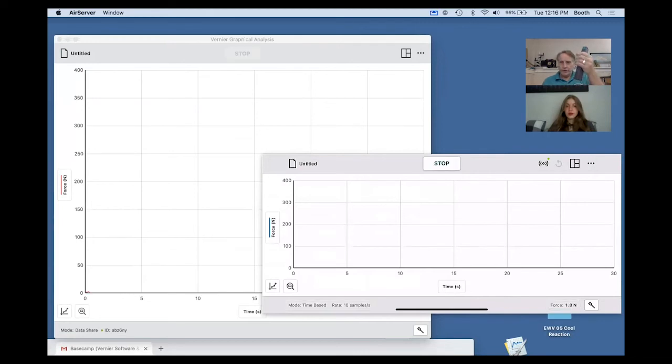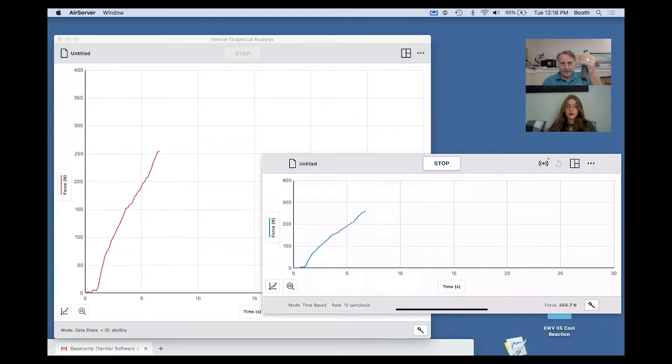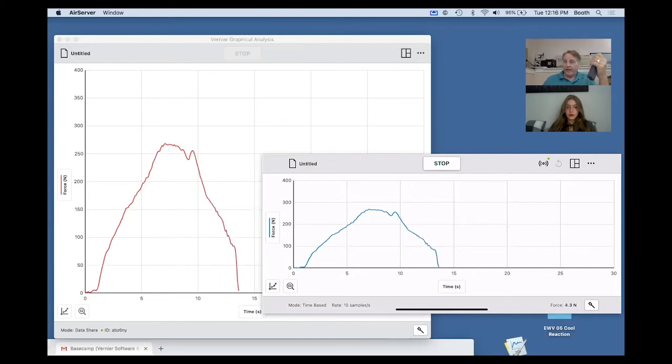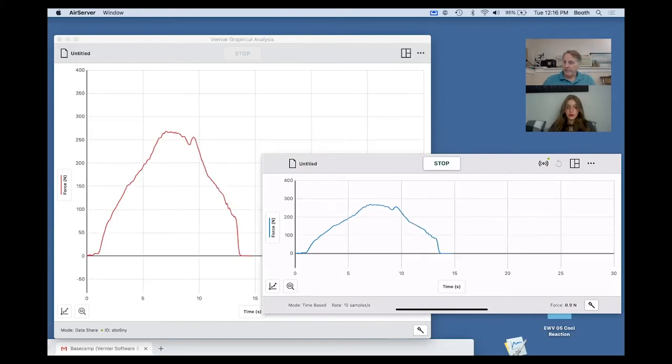So I hit collect, and then if I start to squeeze, I'm squeezing, but you see how they're both going there together. That's actually connected over the internet there. Maybe I get tired, and I hit stop.